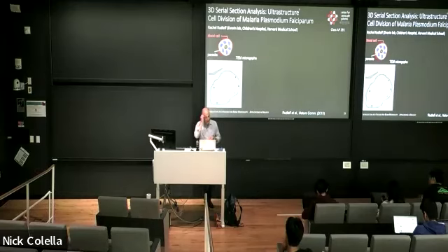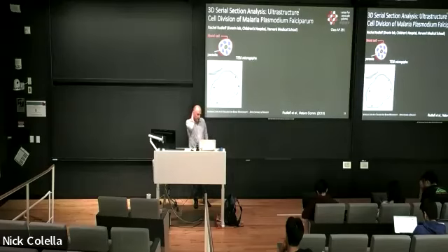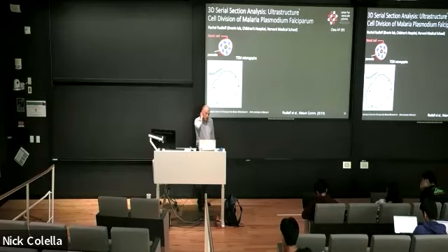And so this here is an example of work that we've done with the Children's Hospital at the medical school. So the lab works on malaria parasites, and we were able to image the malaria parasites as they have infected blood cells.